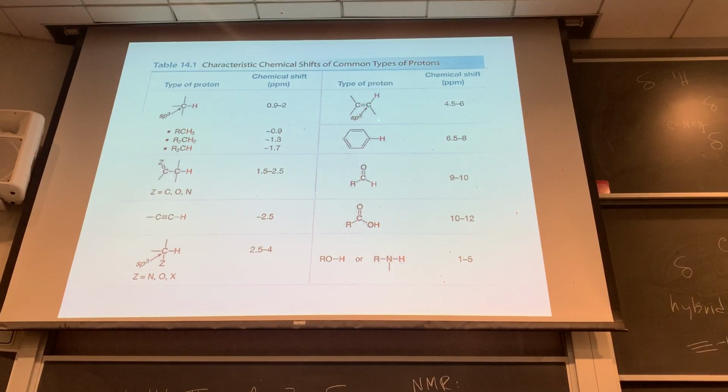Alkene, sp2, so the hybridization and this anisotropy effect come into play here. So we have the alkenyl and the aryl. They're around 5 for an alkene. We have the ring current, a bigger ring here, around 7 for aromatic. On the side of an aldehyde, now it's directly on the carbon that's part of the carbonyl. It's an aldehyde. So that's a very electropositive carbon, which makes that highly deshielded, and yeah, that's shifted way down to 9 to 10.